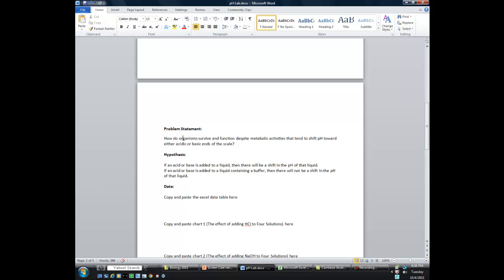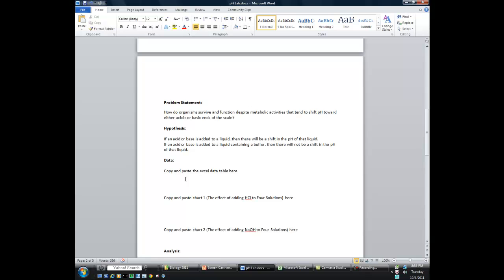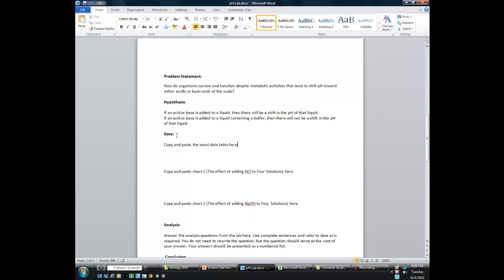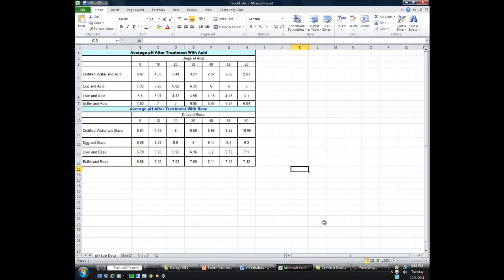All right, so that's it — those two things are what you're going to start off with, and then we're going to move into data. We'll be collecting class average pH values in class, and Mr. Workman and I will be sending you, via email, an Excel workbook that's got the class average data table in it. So I'm going to jump over to Excel and show you what that is going to look like. This is some sample data from a previous class, and I'm going to show you what you need to do with the data table and how to create the charts from it.